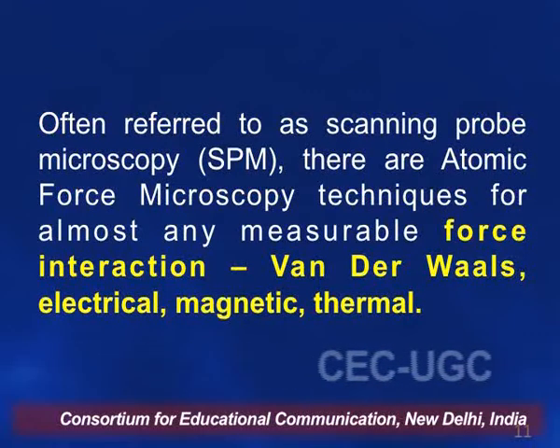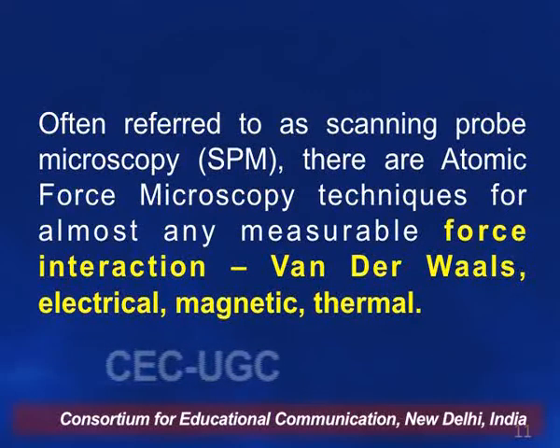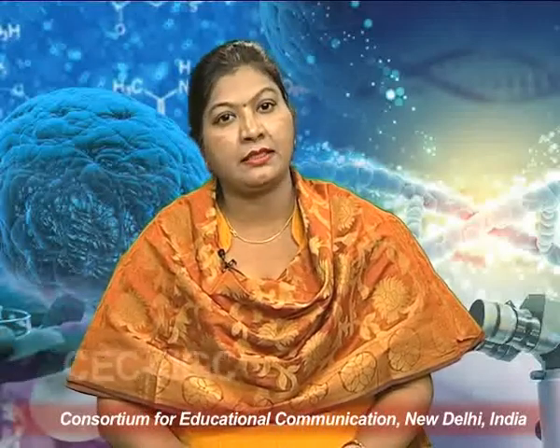As we discussed, atomic force microscopy is used to find the forces between molecules. It is used to measure force interactions like van der Waals, electrical, magnetic, and thermal properties, which we can find through this AFM. Next, instead of using the quantum mechanical effect of tunneling, forces are used to map the tip-sample interaction.